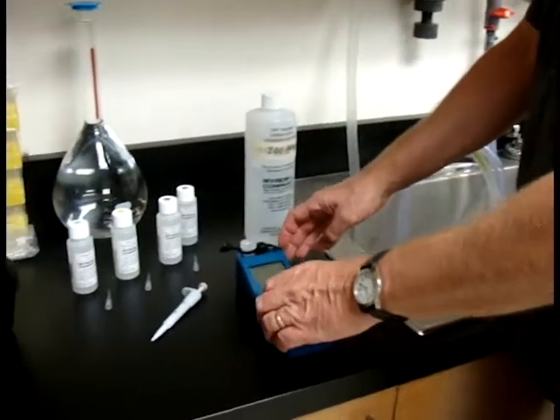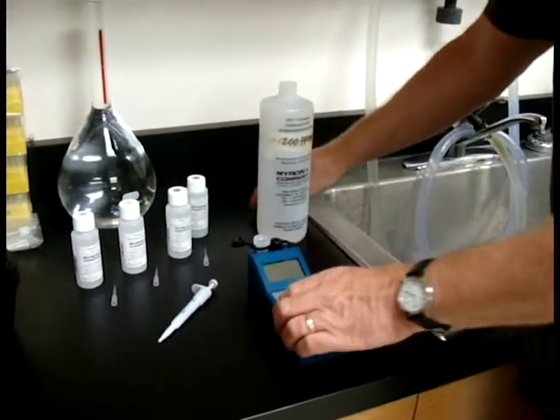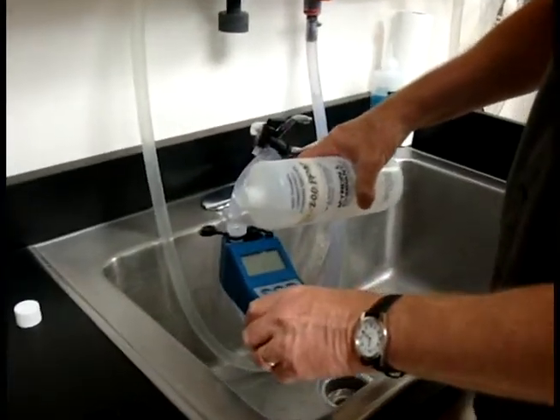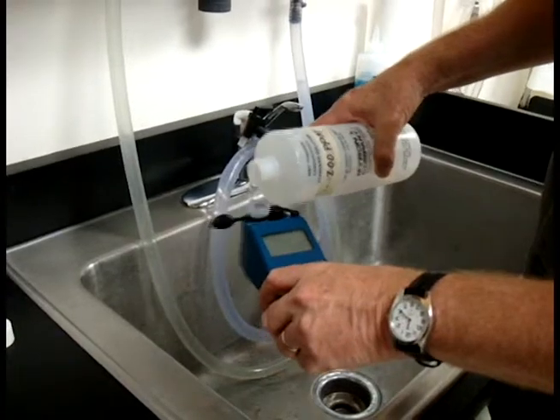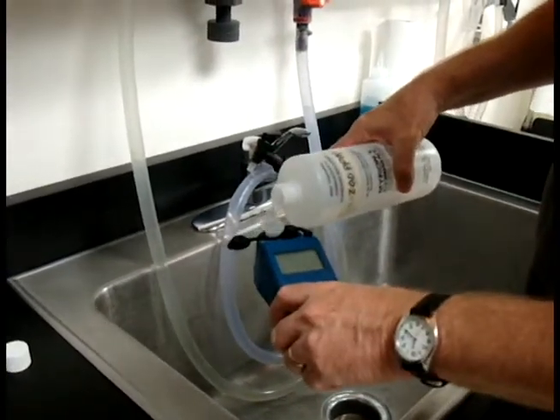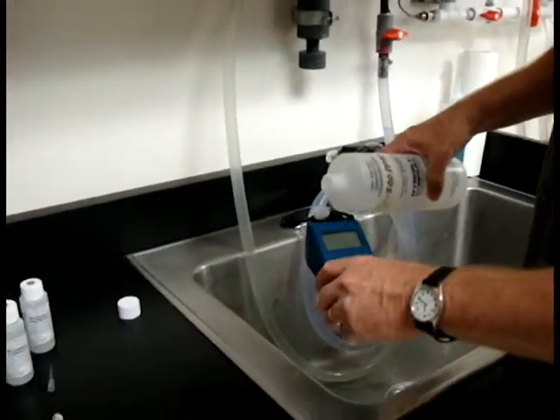Hi, my name is Rich Hansen and I'm going to show you how to do a hardness titration today using the 9P. To begin, we take our solution — today I'm going to use 200 ppm — and rinse our cell cup three times. Get that cap in there, one, two, three, and then fill the cell cup to the top.